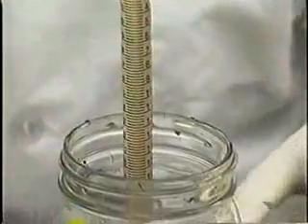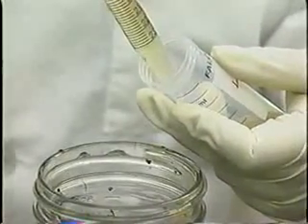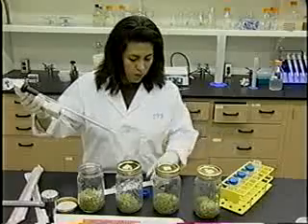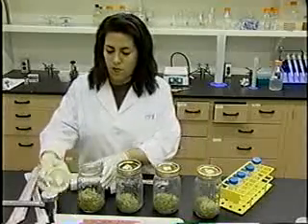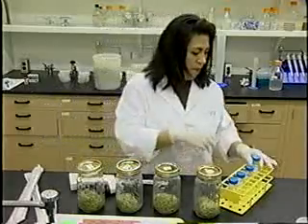The effectiveness of testing seeds for pathogens is increased by growing sprouts from a representative portion of seeds from each lot and testing according to the methods described in the guidance document. However, it is difficult to find pathogens in seed, and negative test results for a seed lot cannot guarantee that the seed is free of pathogens.